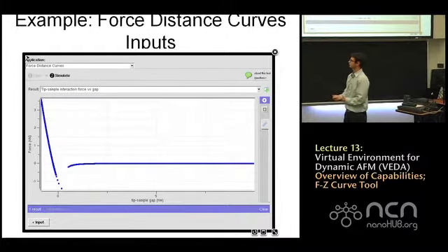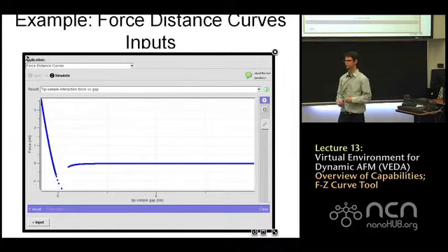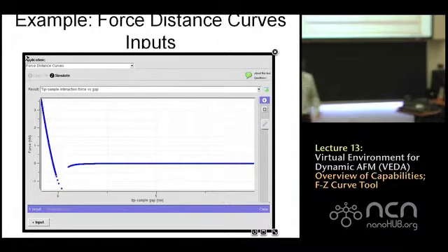One thing you might try is to use a stiffer cantilever, which avoids the snap-in, but the challenge with that is that a stiffer cantilever is less sensitive to forces.